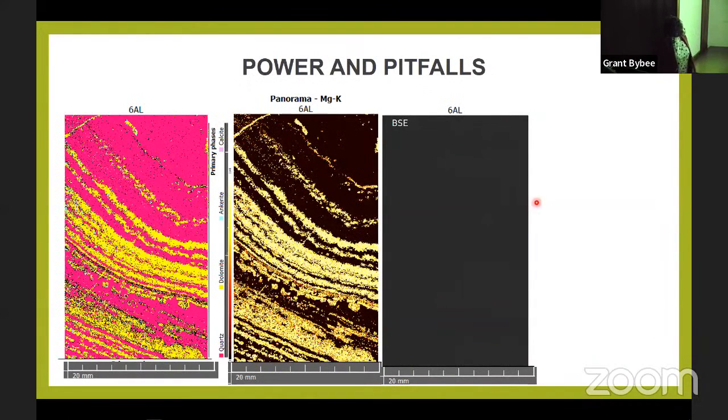And these ones here are carbonate samples. Anna, she's also here, and Zubair, we're trying to understand the amount of dolomite within these carbonates. You can see that there's dolomite, which is yellow, and calcite, which is pink, and the rest is quartz. And then the element map here, in this case, is actually the magnesium, and then there's a BSC image. The BSC image is just like everything is similar, but once you do the map, you can see the different phases present.